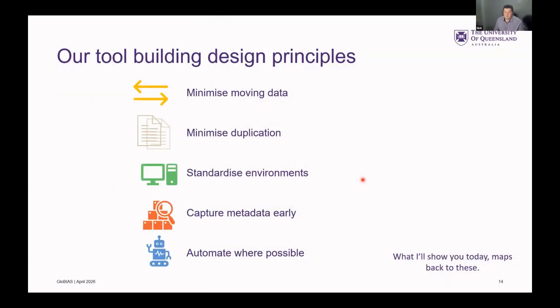So we build a lot of tools, whether they're just simple little PowerShell scripts that run on microscopes to whole kind of platforms and web infrastructures that we build. But we try and follow these major design principles, which is we don't want to move the data, right? I've already said that's the painful part. So once the data gets into the system, we don't want to be copying it back and forth out of the main storage to computers or things like that for analysis. We want to leave it there and access it there.